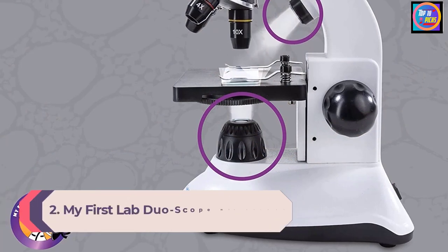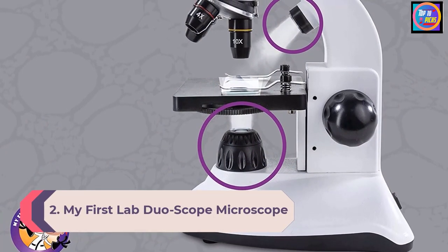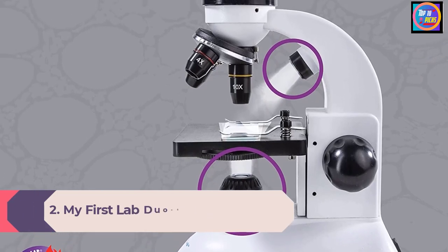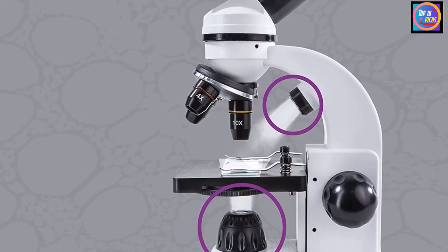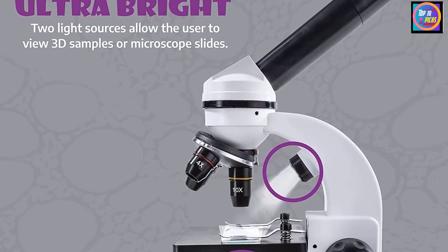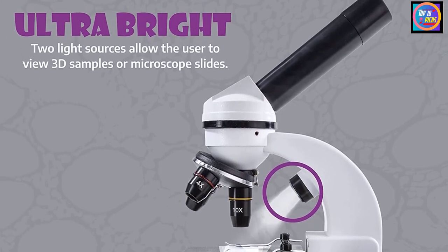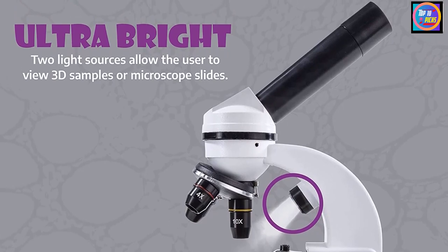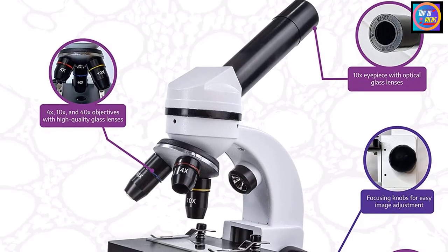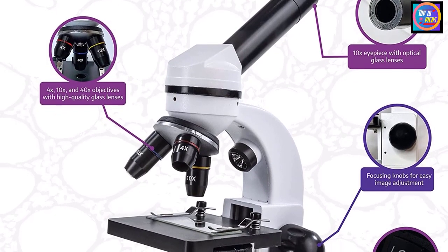Number 2. My First Lab Duoscope Microscope. One of the standout features of this microscope is its combination of a compound and stereo-dissecting microscope. This feature enables you to use the microscope to observe large 3D objects such as a bug or coin. Your purchase comes with three magnification settings including 40x, 100x, and 400x.